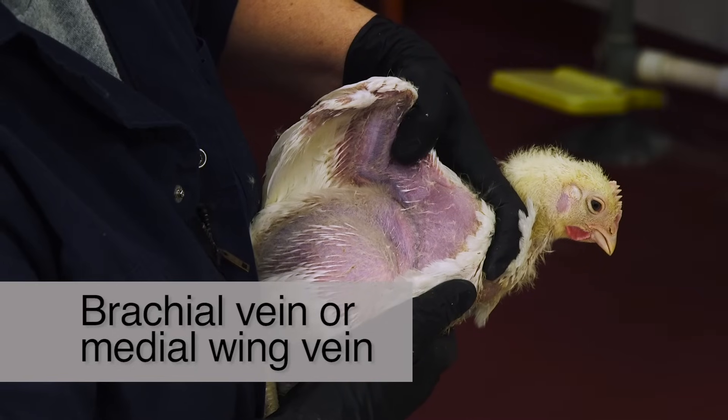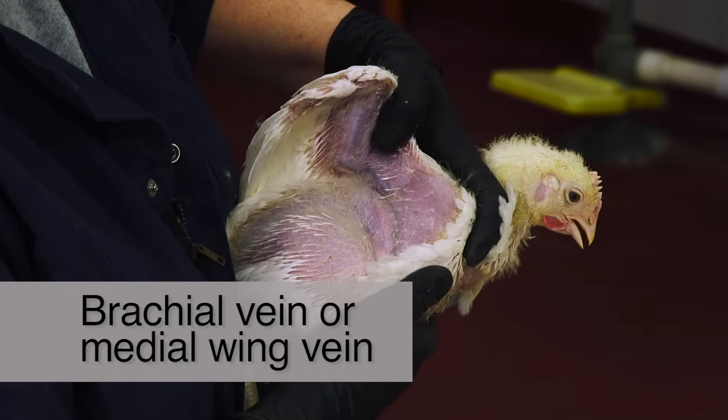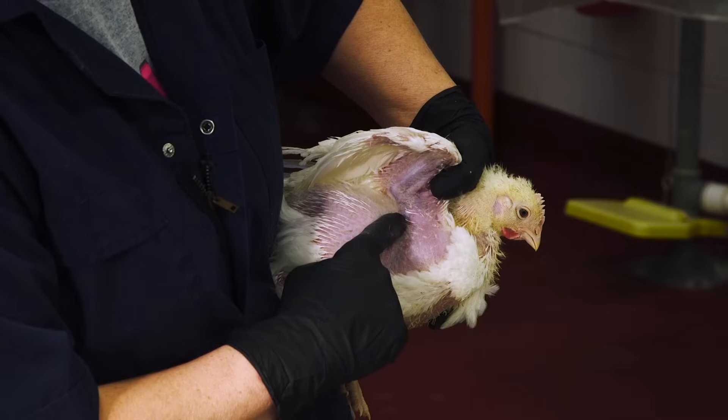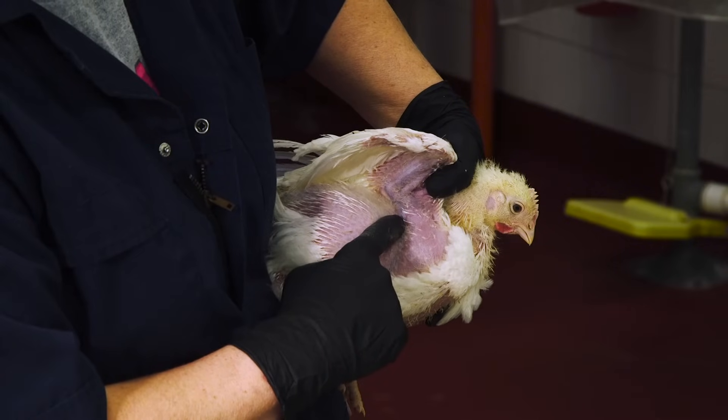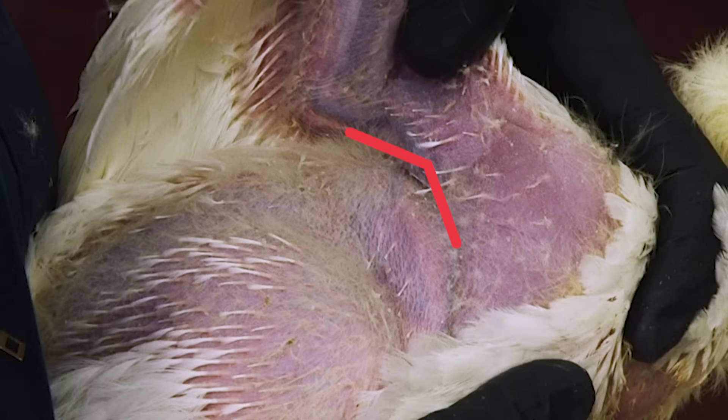Next, let's look at the anatomy of a bird's wing and see where you'll draw the blood sample. The brachial vein, frequently called the medial wing vein, is the most common site for collecting blood from birds. This vein is located on the underside of the wing, between the biceps and triceps muscle, running parallel with the humerus, the arm bone. It is a large vein immediately visible under the skin — the skin is extremely thin and nearly transparent in this area, with few feathers covering the vein.